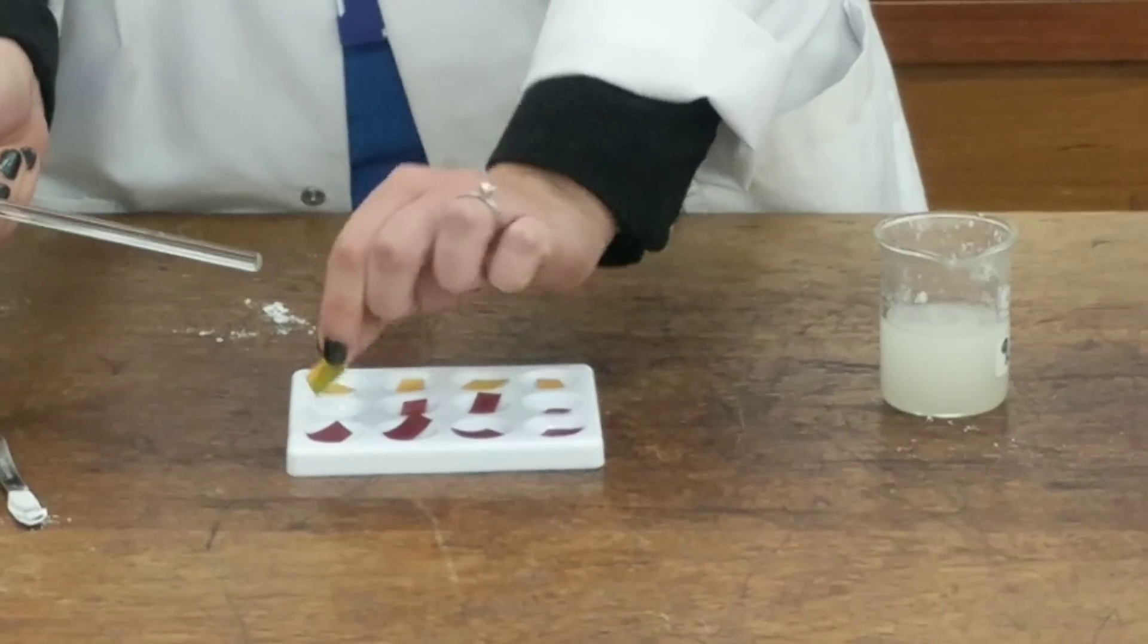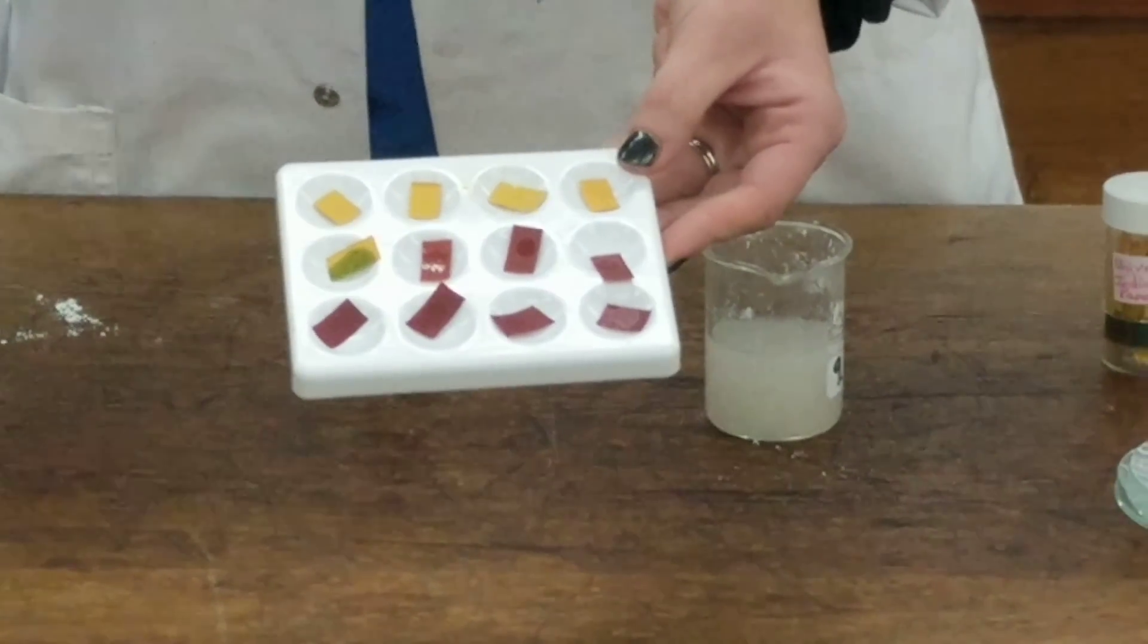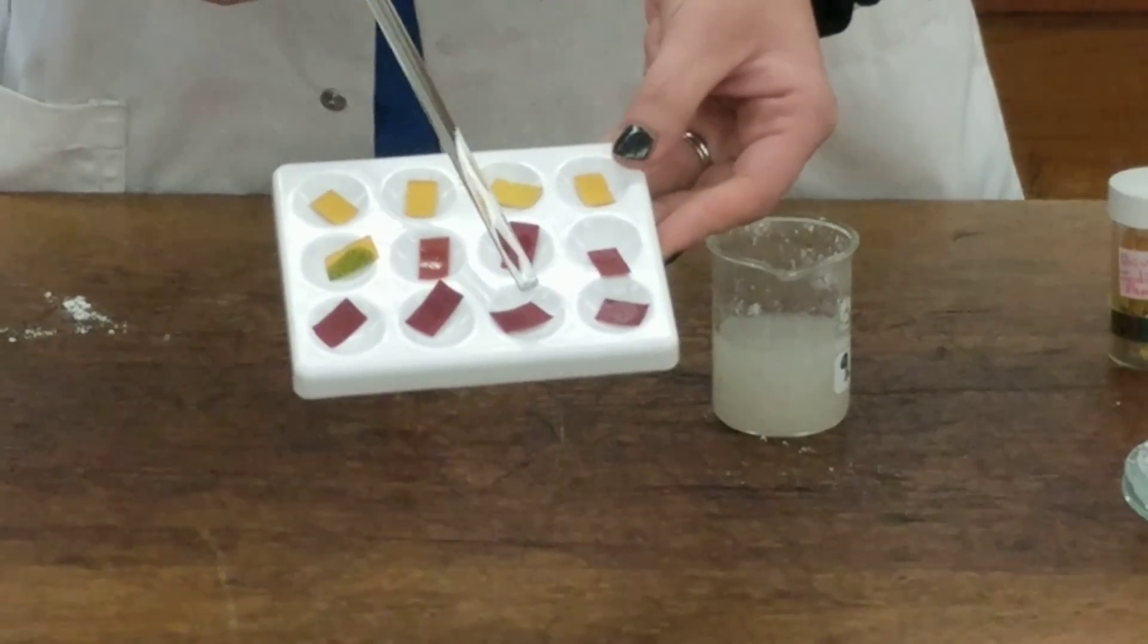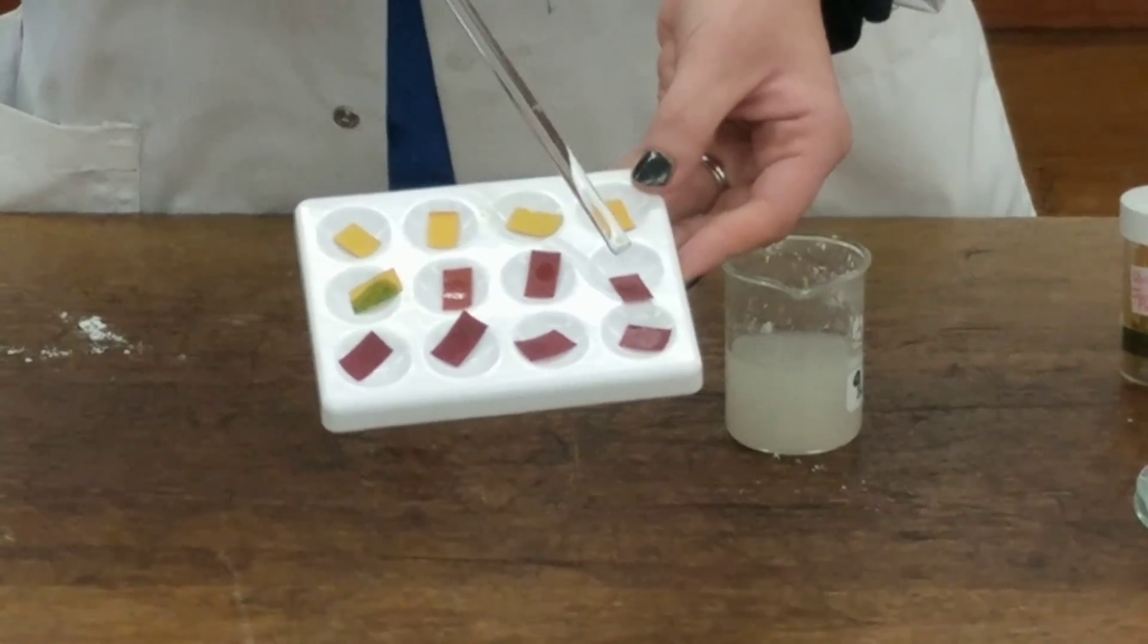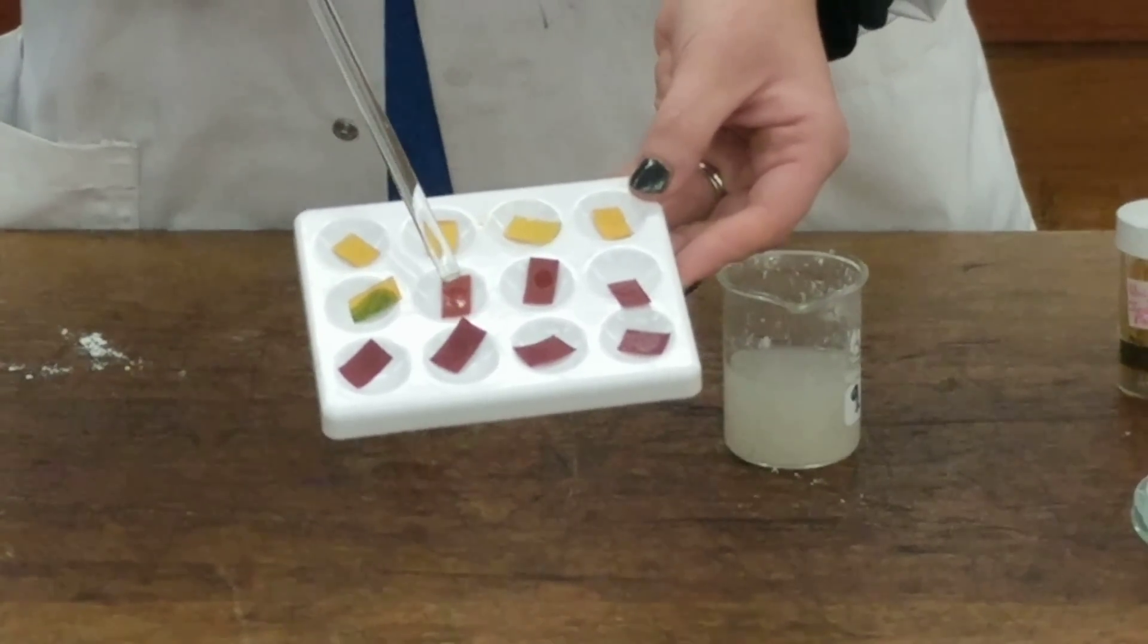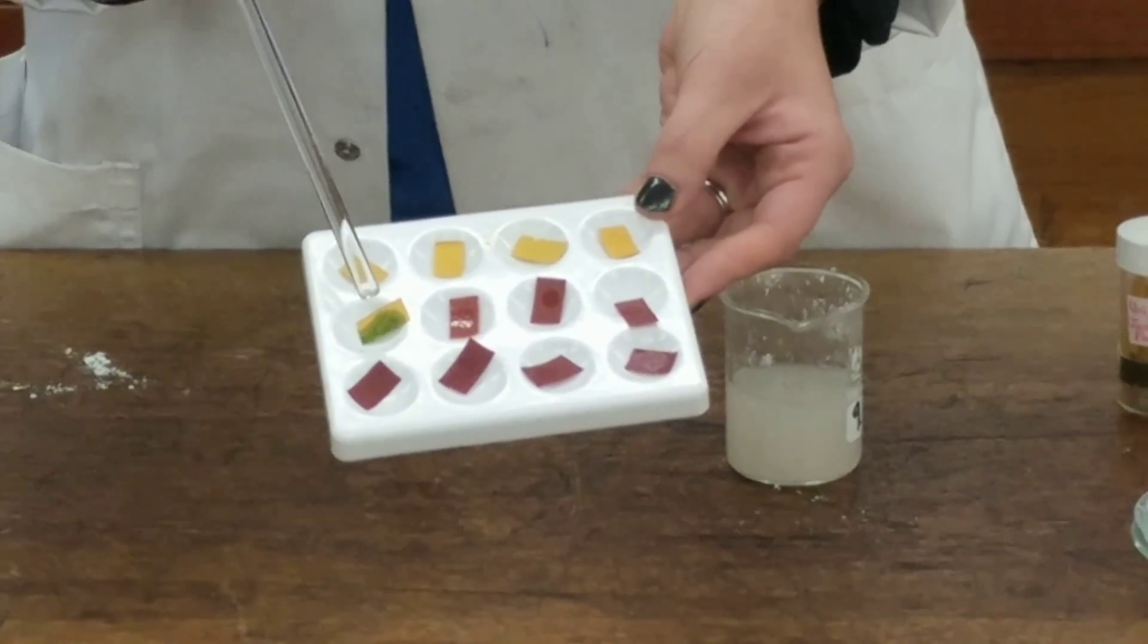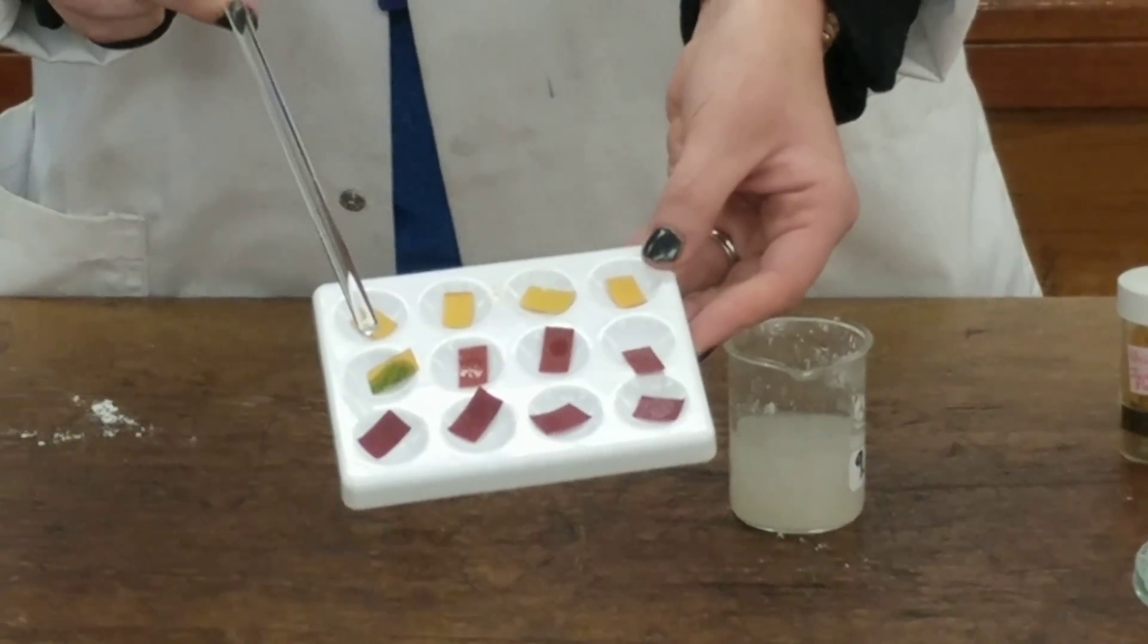And there, you can see, it has taken 0.3, 0.6, 0.9, 1.2, 1.5, 1.8, 2.1, 2.4 grams to neutralise the one mole hydrochloric acid, 50 centimetre cubed.